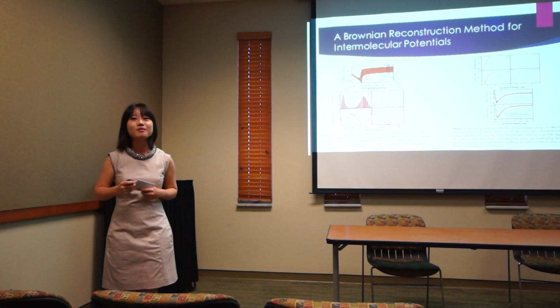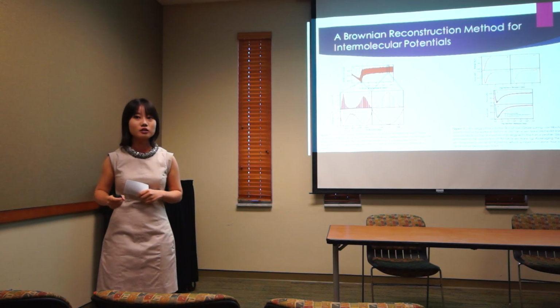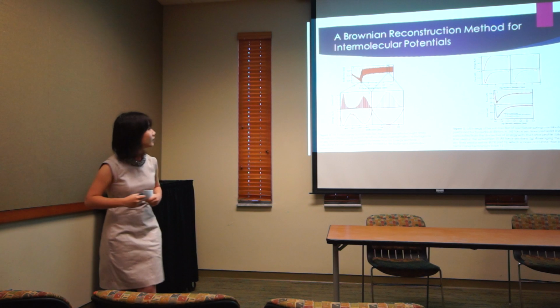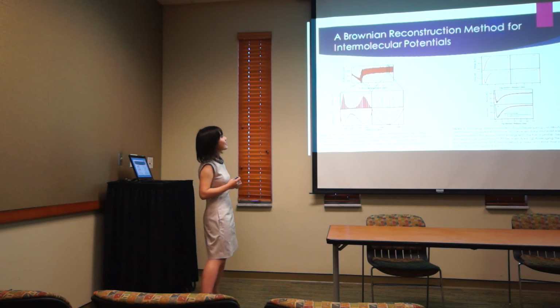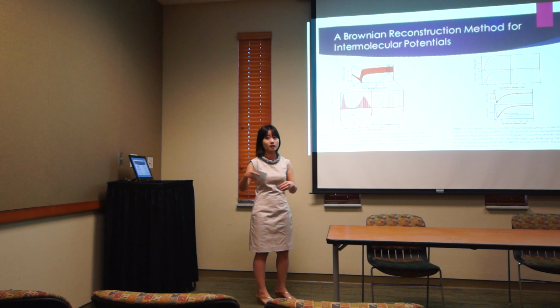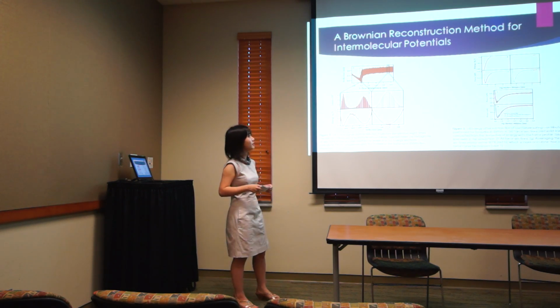Okay, so here comes the most important part of our research. After we have our force distance curve, we're ready to do a Brownian force reconstruction method to construct the intermolecular potential. This is cited from past research, and it is measuring how the protein is behaving in solution. And we think it is very useful in our experiment as well.